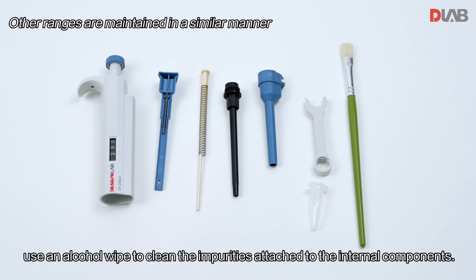Before maintenance, use an alcohol wipe to clean any impurities attached to the internal components.